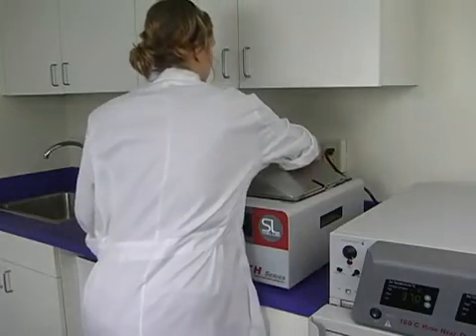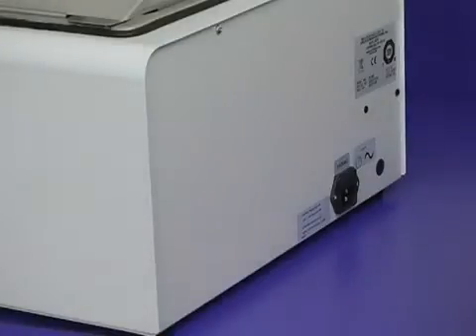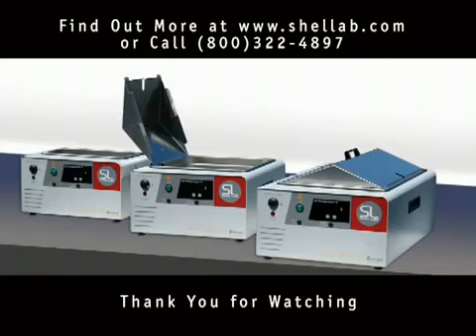The pocket handles embedded on the side of the unit allow the water bath to be easily lifted for cleaning and relocation. Thank you for taking the time to watch this overview of the Shell Lab family of digital water baths. We encourage you to contact Sheldon Manufacturing with any questions regarding the Shell Lab product family.